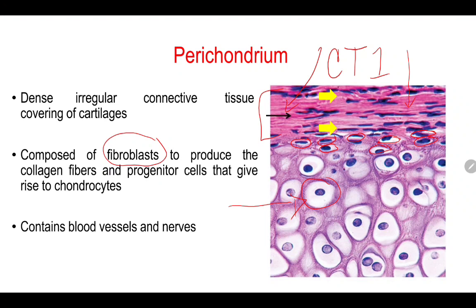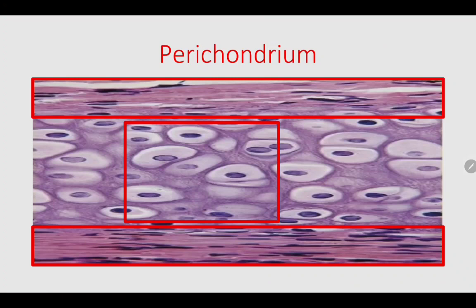Okay? So, in the perichondrium also, it contains blood vessels, capillaries, nerves, and other things. Okay? So, yung mga blood vessels na nandito is, nandyan sila to provide nutrients sa ating chondrocytes. Okay, kasi 'di ba, wala namang blood vessels dito banda. Okay? Wala kayong nakikita ang blood vessels. So it means that the blood vessels are solely found in the perichondrium. Okay? So I hope naintindihan ang ating perichondrium? So let's move and check for a more detailed picture na ating perichondrium.